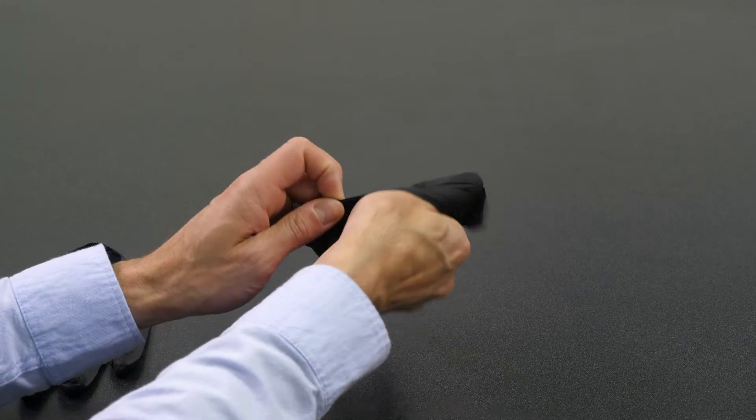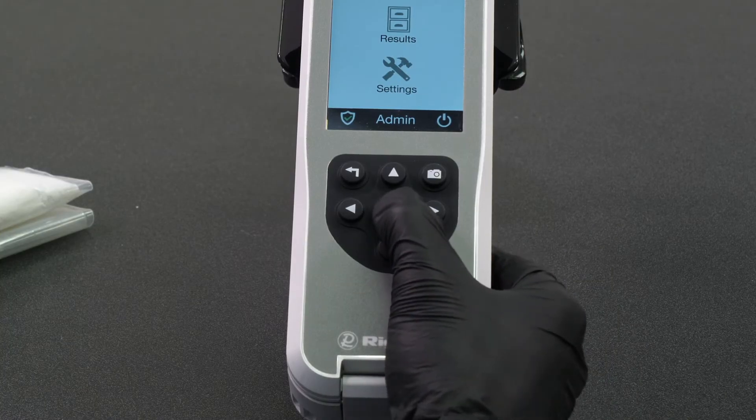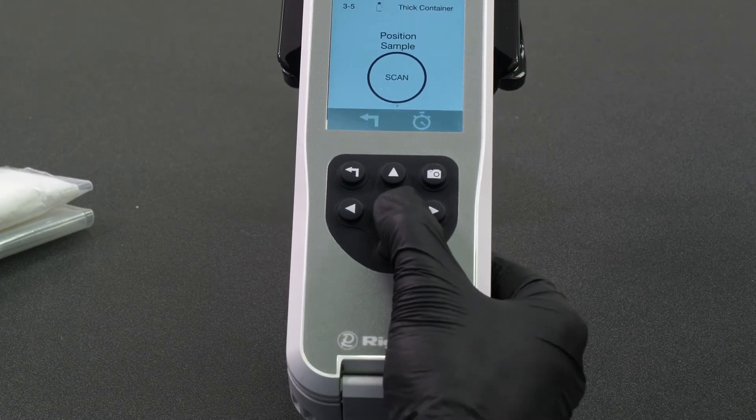The Rescue Flex can be operated either by keypad or touchscreen. If you're wearing light PPE and operating the instrument by touchscreen, blue latex or black nitrile gloves tend to work best and are recommended. If using heavy PPE, you will generally want to use the tactile keypad for interfacing with the instrument. The instrument interface is extremely easy to learn and use.